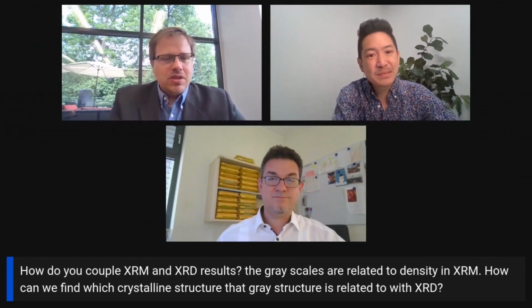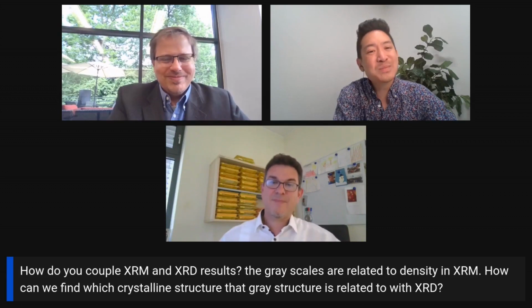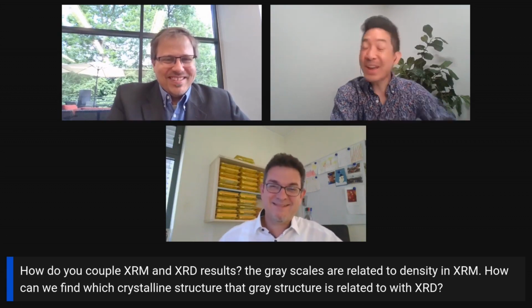All right, next question, also kind of coupled. How do you couple the XRM and XRD results? The grayscales are related to density in XRM. How can we find the crystalline structure that the gray color is related to? Okay, I'll take a stab at it.